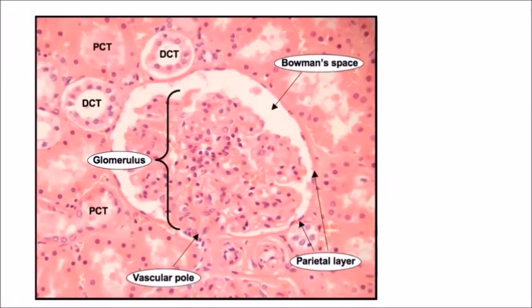Distal convoluted tubules have small pale stained cells with wide lumen. The medulla is a dense mass made up of three types of tubules: Henle's loop with small diameter, collecting tubules having large diameter with deeply stained cells, and collecting duct of large diameter with lightly stained cells. In this way, we are able to identify the cross section of kidney.